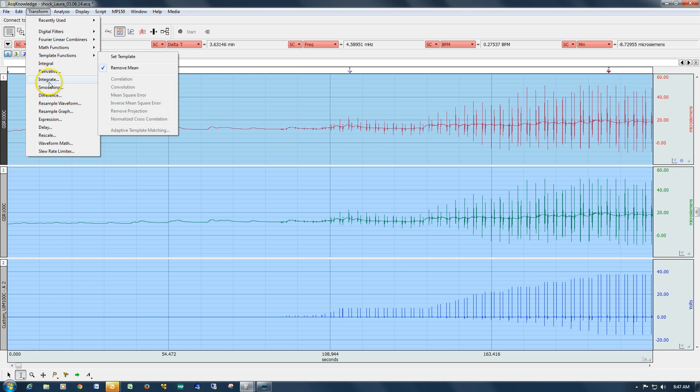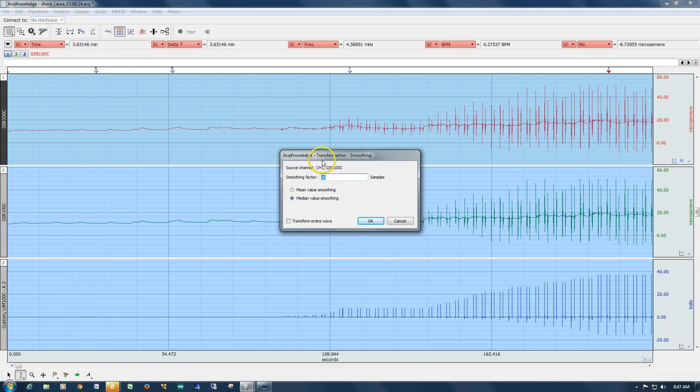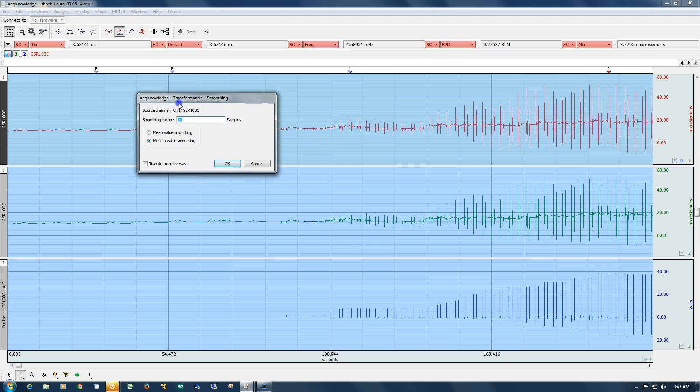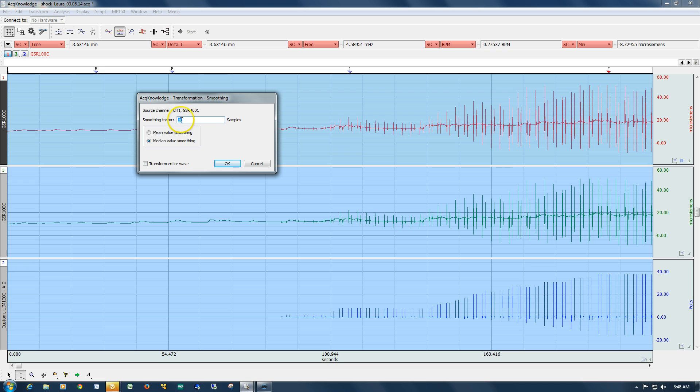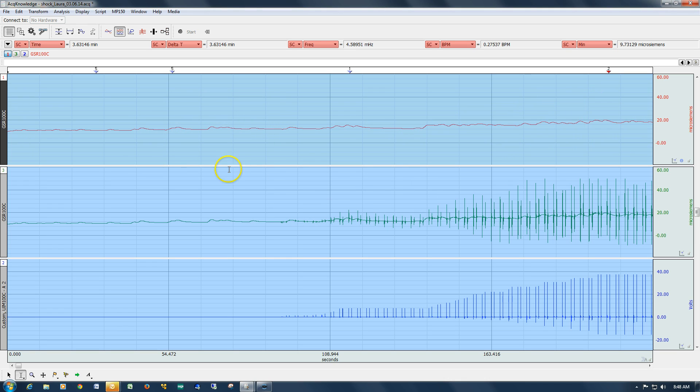So if we go back to the transform menu and smoothing, I've got this set so that we're looking at the median smoothing now. I've set my sample at 20, which, remember this data is sampled at 30 samples a second, so this represents a reasonable amount of time, 600 plus milliseconds. And we can see that we've eliminated these particular spikes.